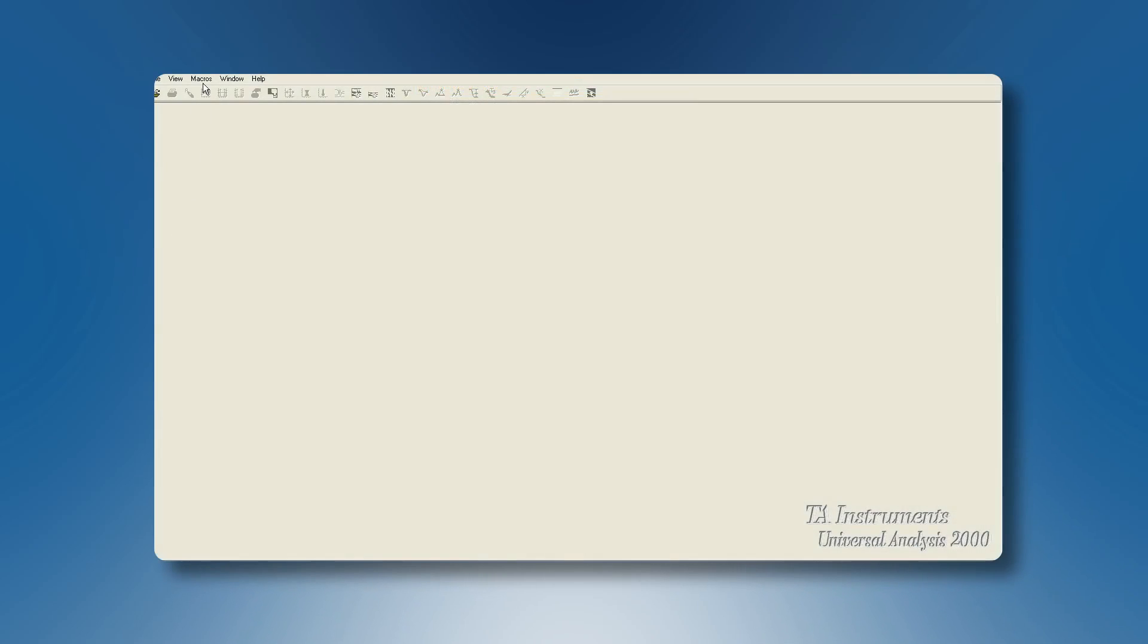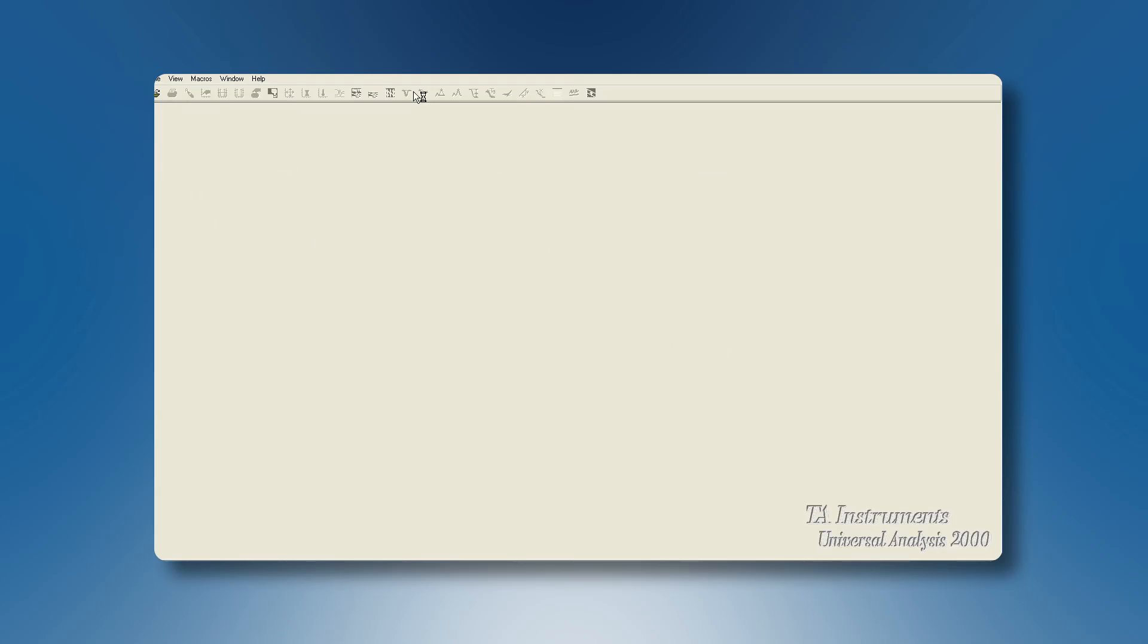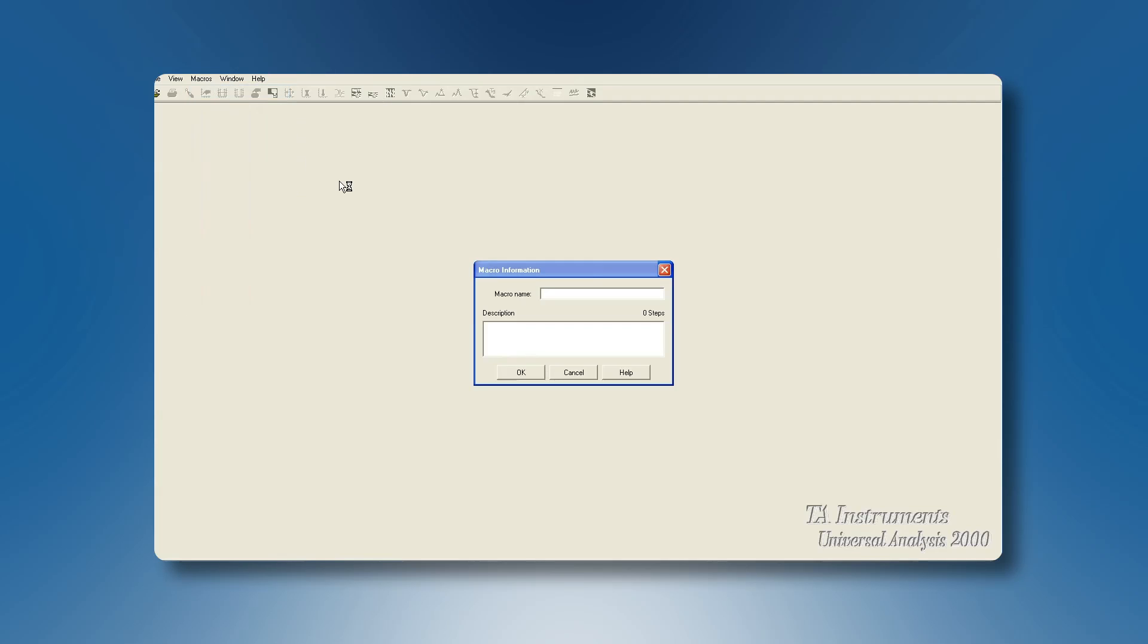Start by creating a new macro file and give it a suitable name. In this macro file, create a new macro and give it a name. If desired, you can add here some descriptive info about this macro. Click on OK.